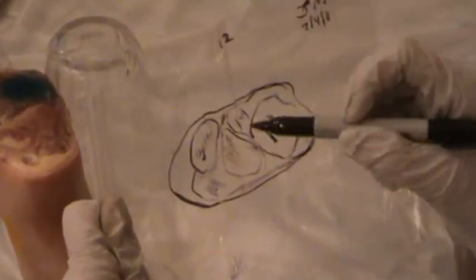I turn on a little air conditioning to try to make it a little easier to write with my Sharpie. You can see on my baggie that I've labeled the bone, the muscle, and the necrotic area with a key down in the lower corner of the baggie.